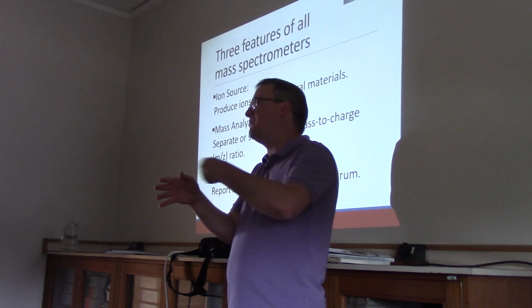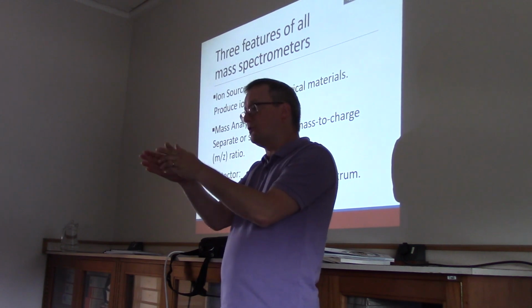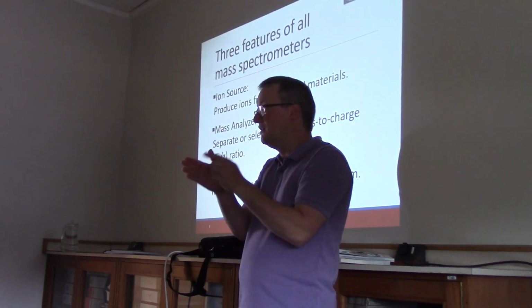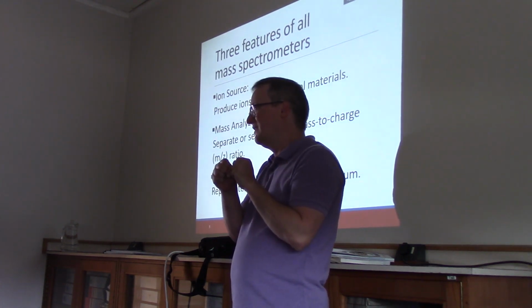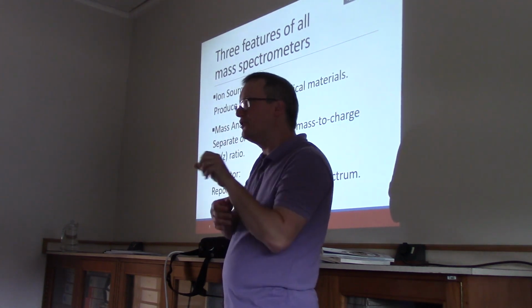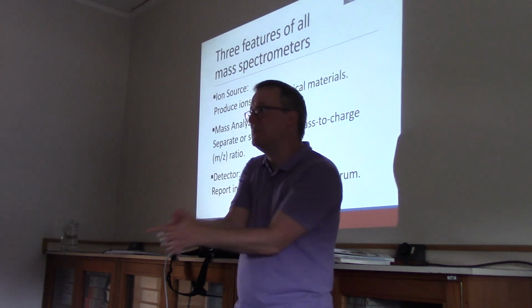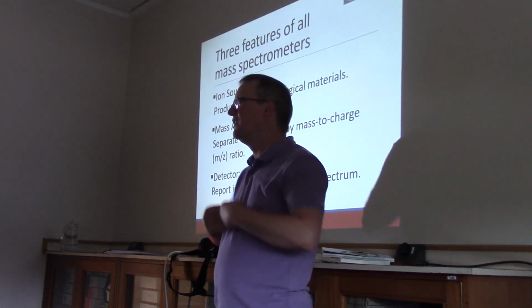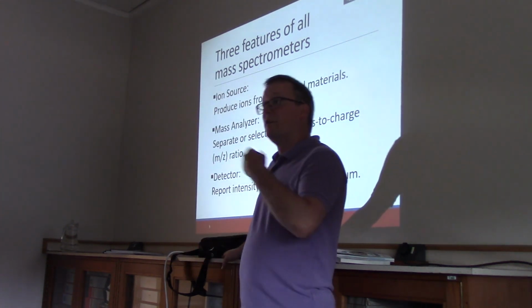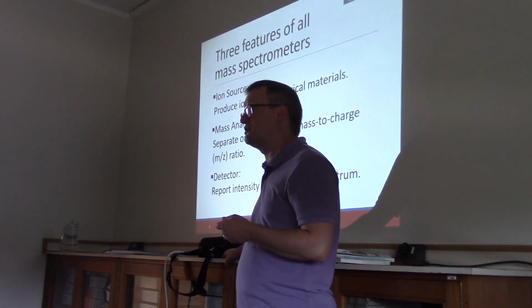So you have a gun at the back of the tube that's firing particles that are then being directed to a particular location on the face of the screen to cause light to be emitted. And if they're directed at this part, you get a red light. If they're here, you get a green light. If they're here, you get a blue light. And so by rastering this beam of particles to each of these parts of the screen, we were able to produce a visual image to work from. A lot of how televisions work has a lot to do with how mass spectrometry works.